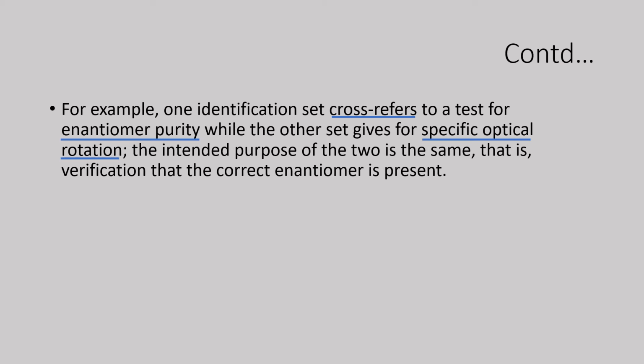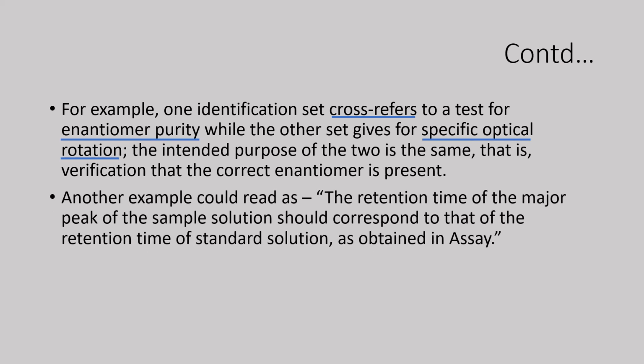The output is same, so the intent is same. Another example could read as the retention time of the major peak of the sample solution should correspond to that of the standard solution as obtained in assay. We come across in several HPLC tests to confirm the retention time of the main peak of the sample should match with that of the standard peak in the assay test. You can notice such tests in many HPLC tests.